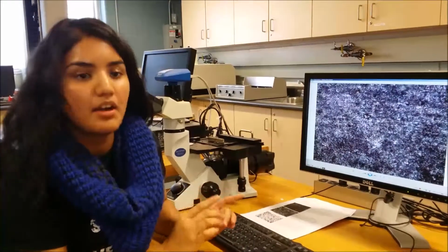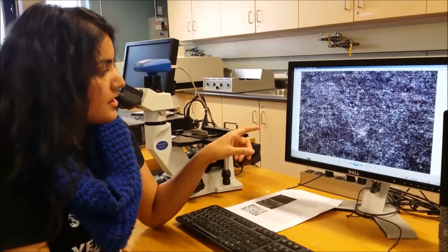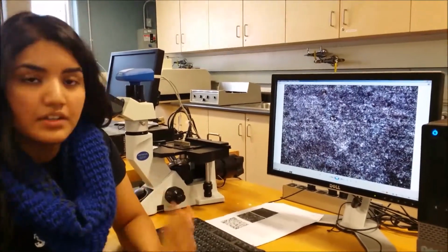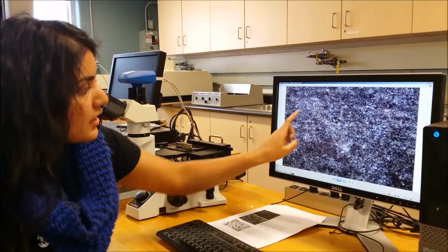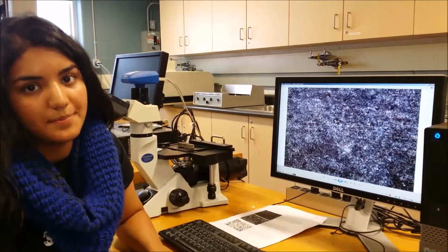So this is the last part. It is the lowest carbon, and to the right side. You can tell the grain sizes are very small, and you can see a little bit of sulfur here as well, and it is the hardest part of the material.